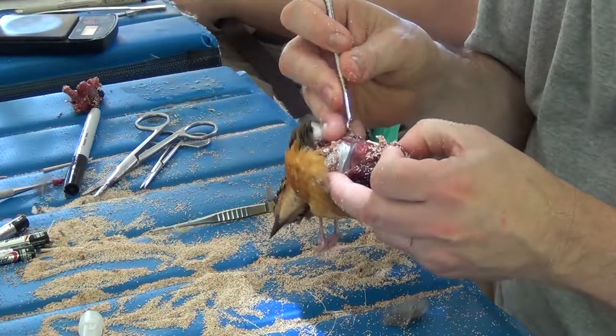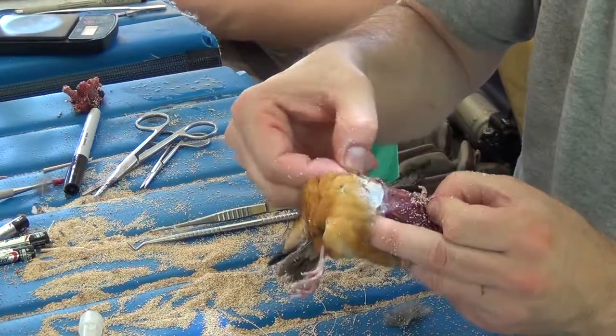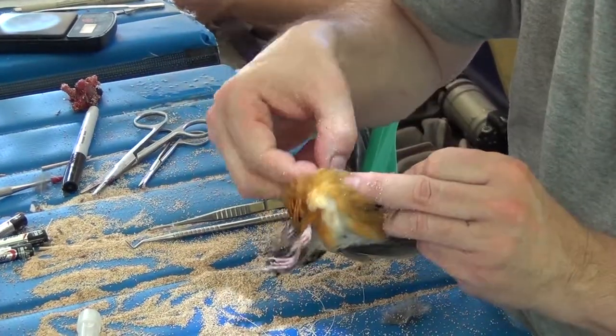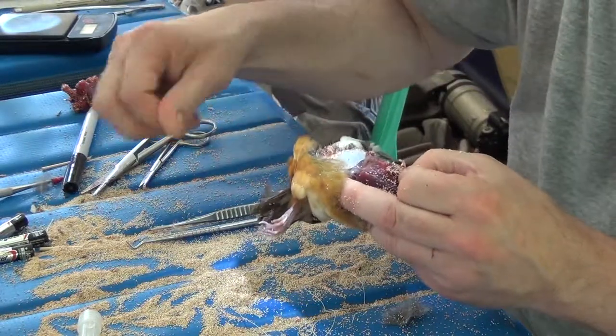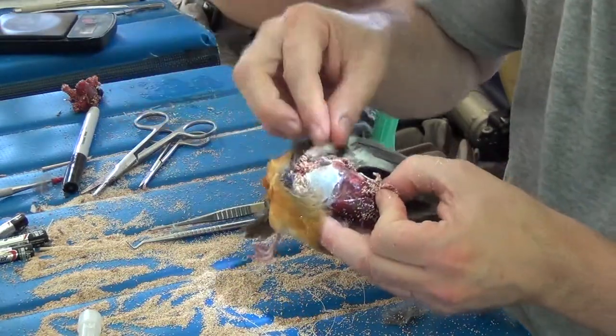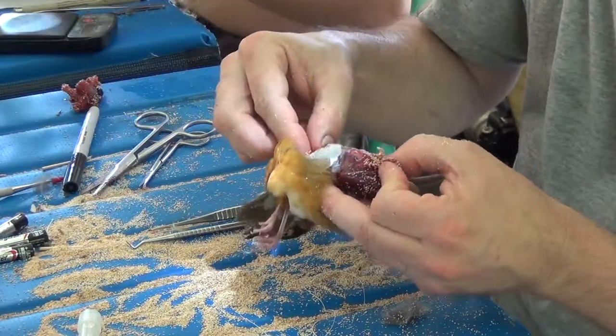I'm coming up on the first leg. You can see that this bird is not molting, which is good news because I'm kind of hoping that it's an adult female. I'm removing the fat from the inside of the skin just so that that fat isn't there in the final specimen.